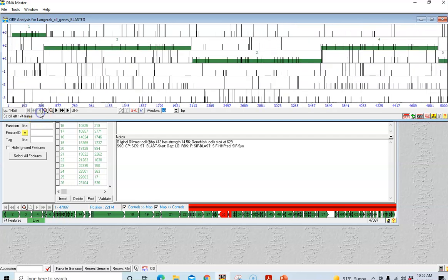Okay. So there's our gene number 1 that's in this top reading frame, and gene number 2 is actually going to go down to the second reading frame. So the phage will use these various reading frames. If I look at gene 1, the lines going all the way up to the top are stop codons, and all of these going halfway up are start codons. So again, that's our job, to figure out which one of these is right.